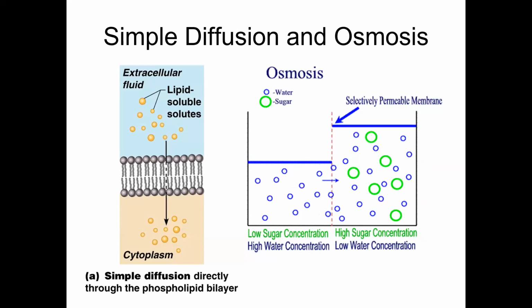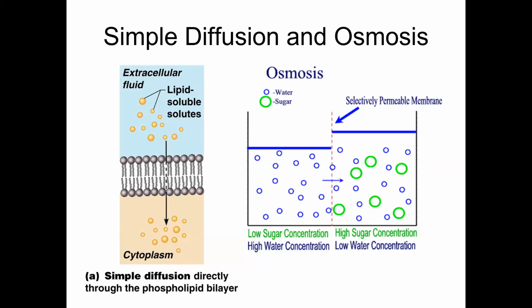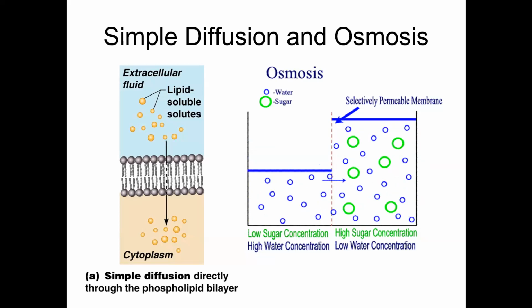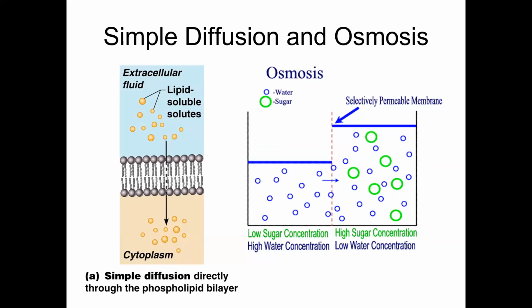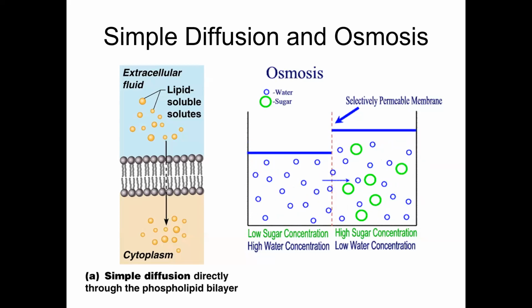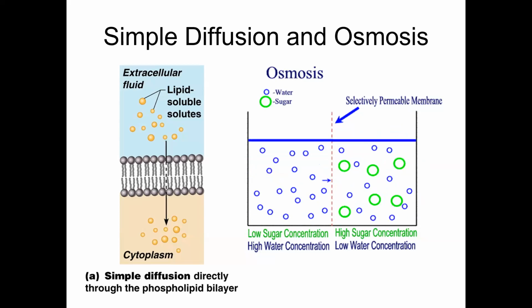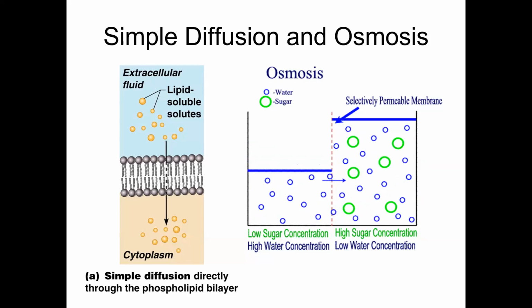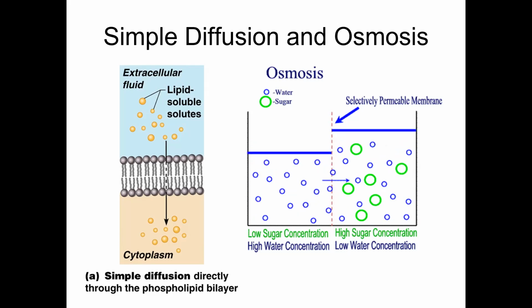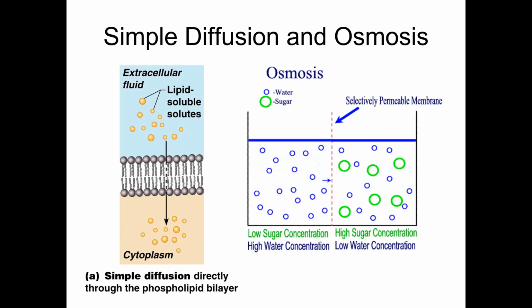And we've done this in the past where we've had everybody do one, and we've used different molecules. You can use starch, and you can use glucose, and you can use salt. You can mix them up so you have salt inside a beaker and glucose inside the cell. It doesn't matter. Solutes are solutes, whatever the water level is, the highest water level, it's still going to work. We'll check this at about 2 o'clock or thereabouts and see what the weight gain is. It's very simple. If the weight goes up, it's because water was going into the cell. If the weight drops, it's because water was leaving the cell. And that's what osmosis does.